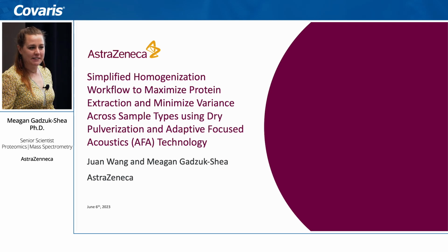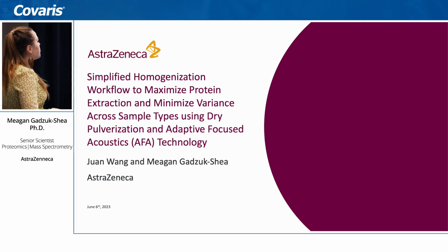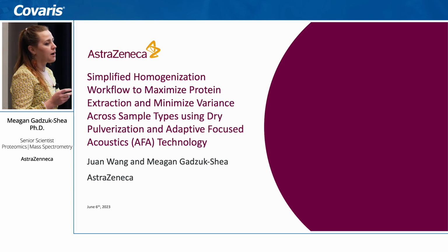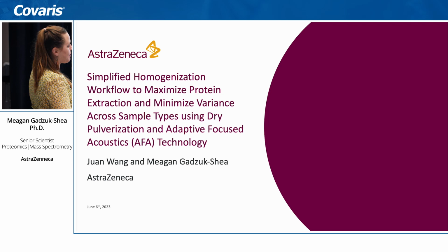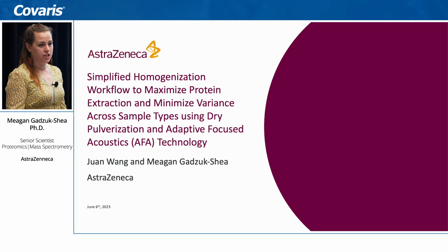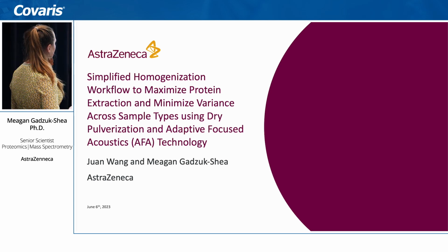I'm Meagan from AstraZeneca, and I've been working with my teammate, Juan, to simplify our homogenization workflow, maximize our protein extraction, and minimize sample variance in the mass spec analysis using dry pulverization and the AFA technology that we're all here to hear about.